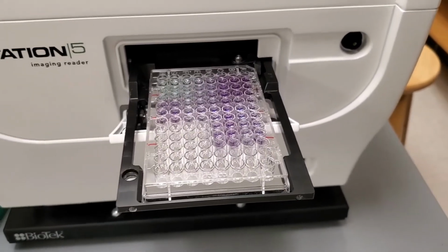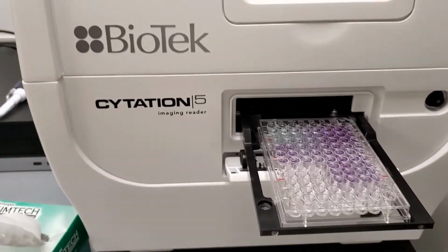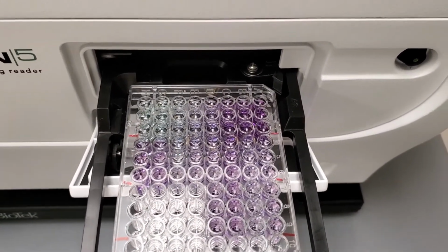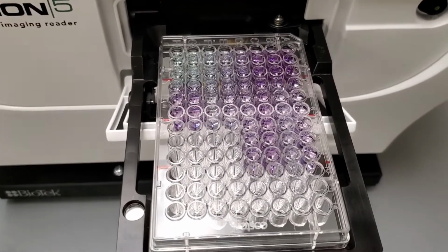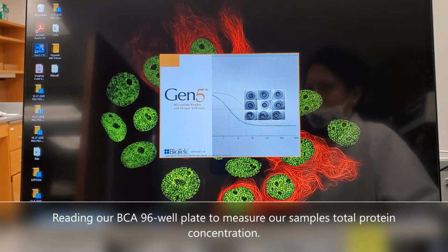Now that my samples have incubated for 30 minutes, I'm ready to read my 96-well plate. I'm using the BioTek Cytation 5 imaging reader, and the orientation of the plate goes this way, with the letters A, B, C, all the way to H facing away from you. Once we're ready to read our plate, we're going to go onto our software, the Gen5 3.10. Open that.